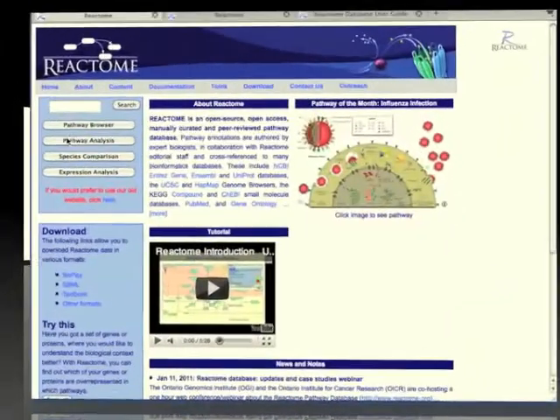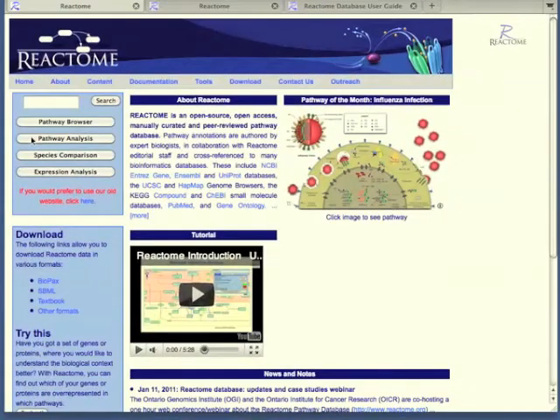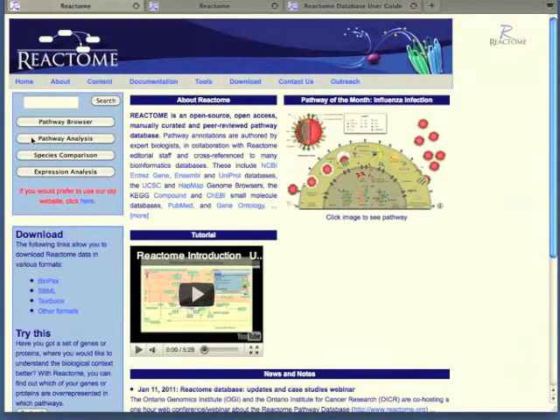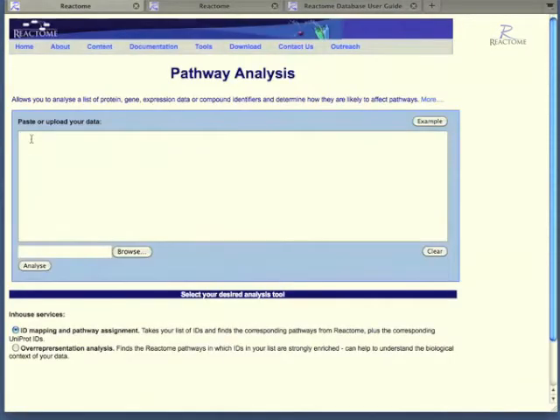To begin the pathway analysis, click on the pathway analysis button on the left hand side of the front page. The pathway analysis window will open.